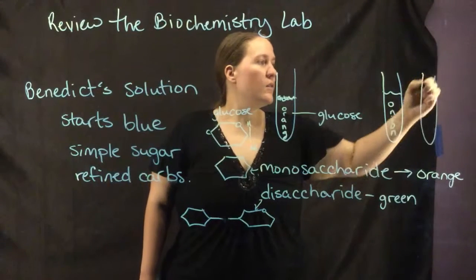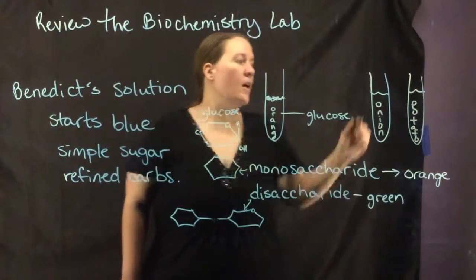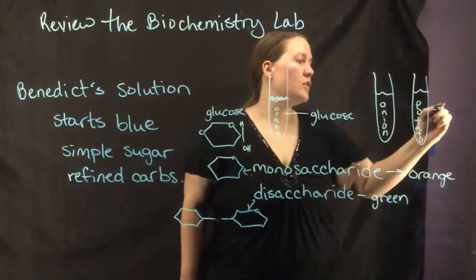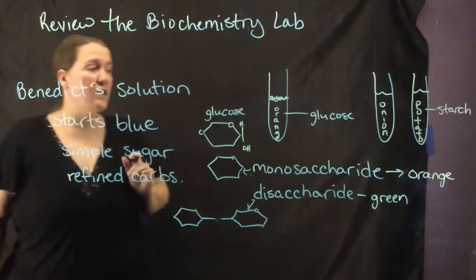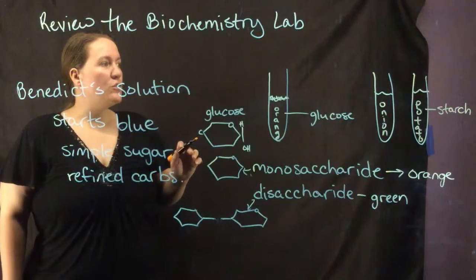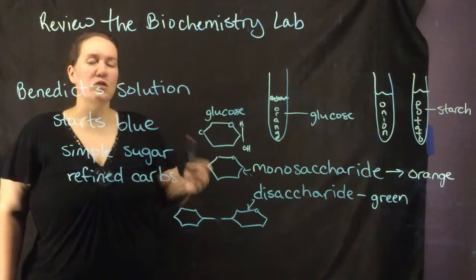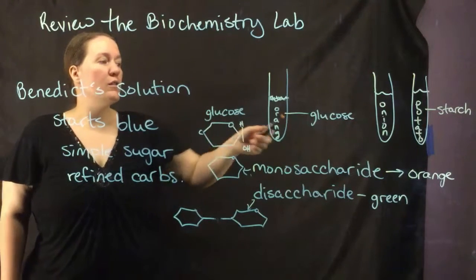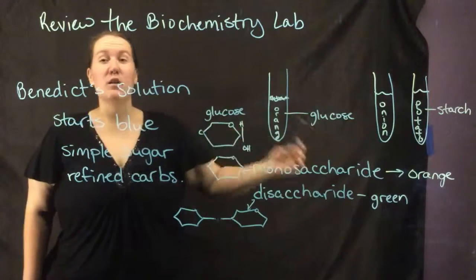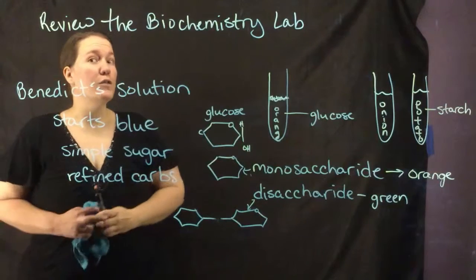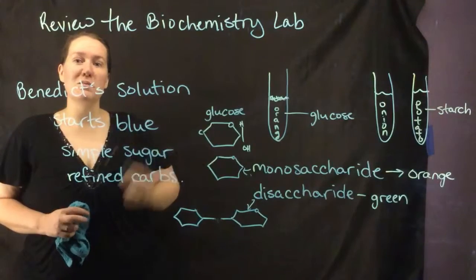A lot of people said that the potato was positive, and potato is actually starch. Sugar comes in long, long chains. Starch is not a simple sugar, so it shouldn't have come back positive. It should have just been the glucose - it's orange - and then the onion should have been your other positive result. So hopefully that makes sense, that the Benedict test is for simple sugars.